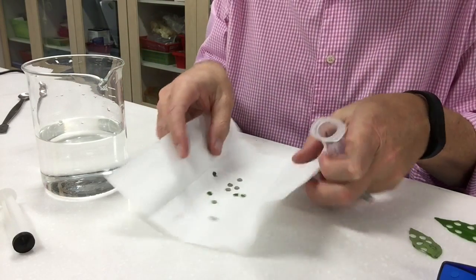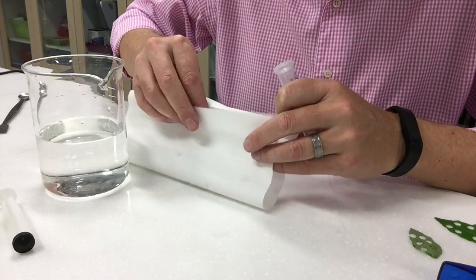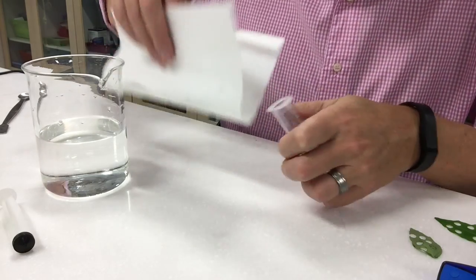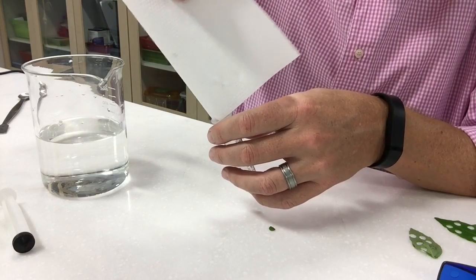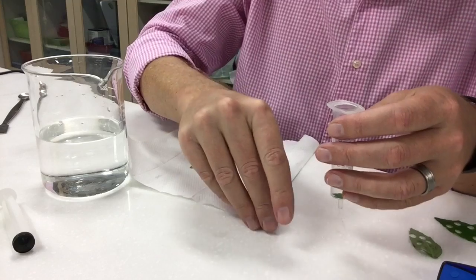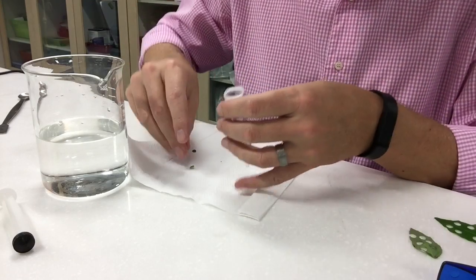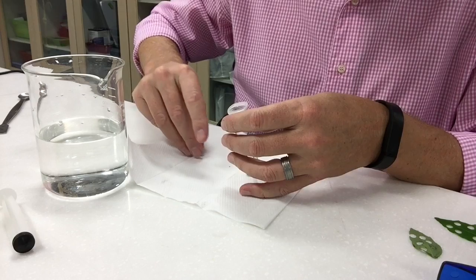So the first thing you need to do is you need to put your leaf discs into the syringe. So you want to try and get those down in there and drop one there. Carefully try and pick those up and pop them in. So I've got about 10 of them in there.